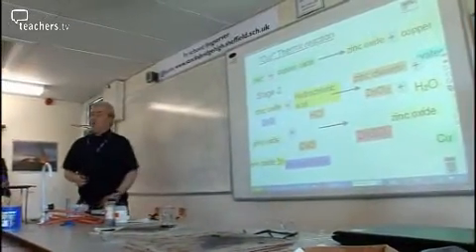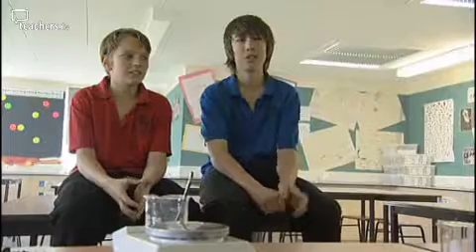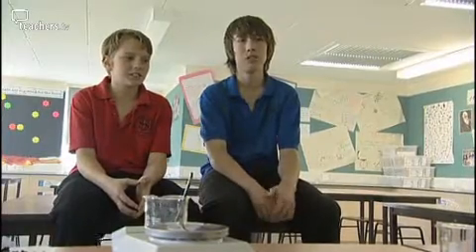That's our Thermit reaction. I liked today's lesson because of the bright lights. It was a bit like a firework display, only little and not with fireworks. I thought it were quite amazing that such a little amount created such a nice explosion. I find it easier when I'm actually doing something than the bookwork because, well, it's just more fun, so it sticks in my head a bit better.